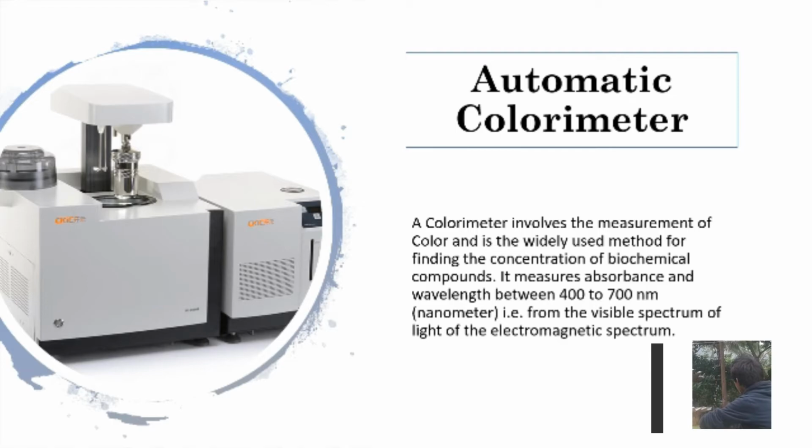For example, mag-assess ka color sa bird sa ilang feathers, or pag mag-measure ka o mag-monitor ka sa color sa various foods and beverages like anything, and including vegetables, sugars, screening the quality of water, quality of your concentration sa imong compounds, sa imong thesis pananglitan, sa imong plants. Na ba sila any impurities when they are so precise, molecular level.